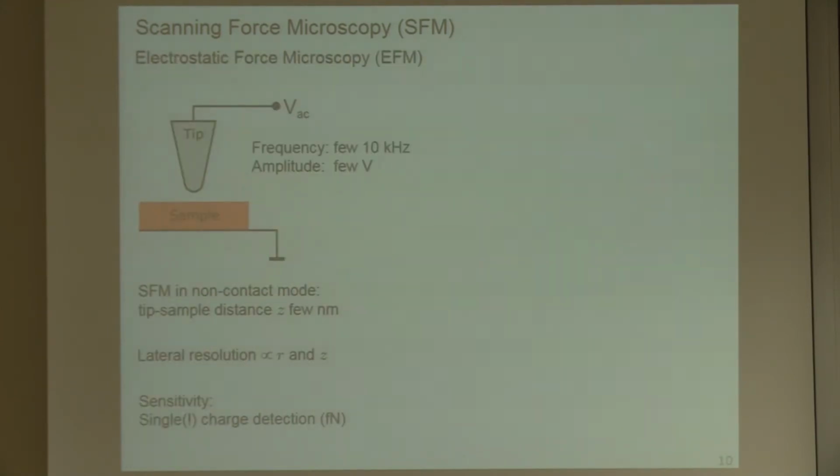Okay, I now come to a technique which is very much used and which is not that clear in scanning probe microscopy. It's to measure electrostatic forces. So basically this is trivial. You have your sample, you have a tip which you can charge, and then you have a Coulombic force in between the tip and the sample, and that's what you can measure.